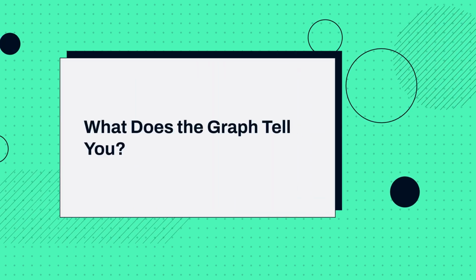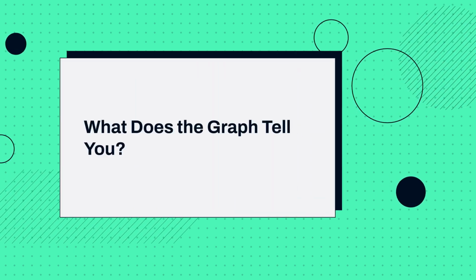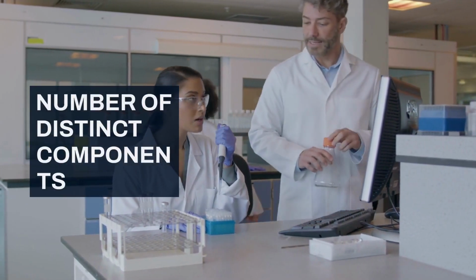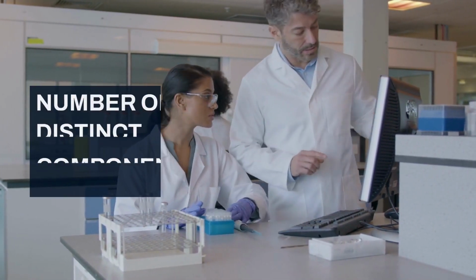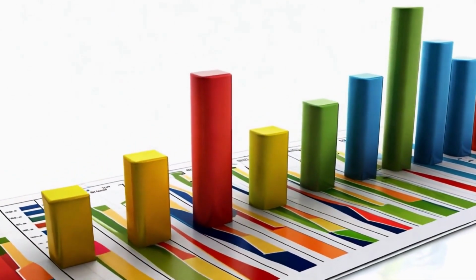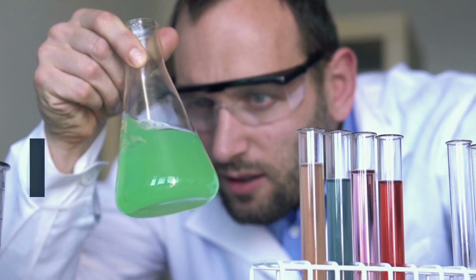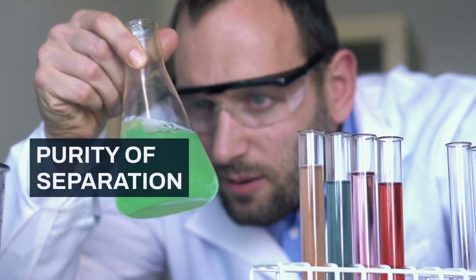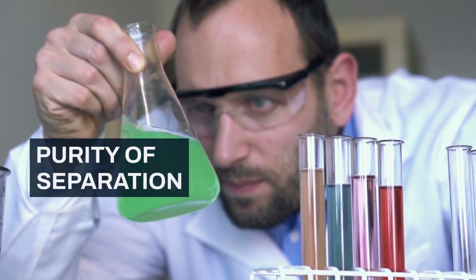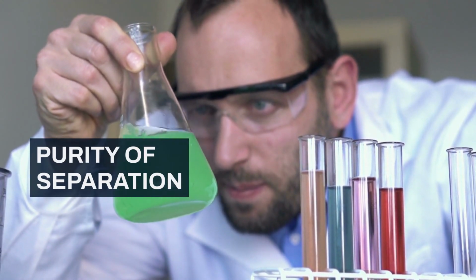So, what does the whole graph tell you? It tells you how many different components were in your sample, indicated by the number of distinct peaks. It tells you the relative amount of each component, shown by the peak heights or areas. It also gives you an idea of the purity of your separation. Well separated, sharp peaks mean a good, pure separation.